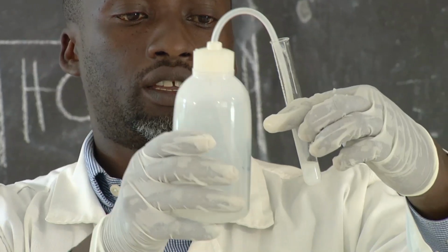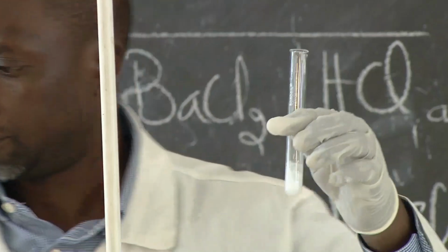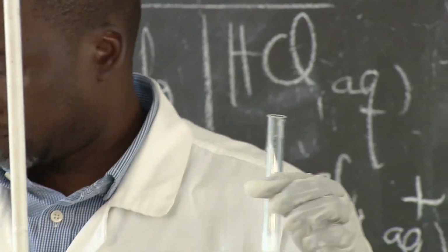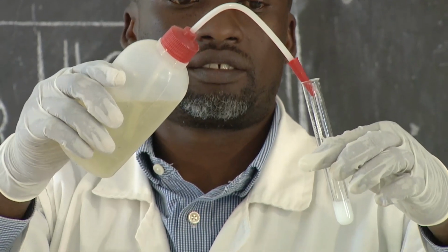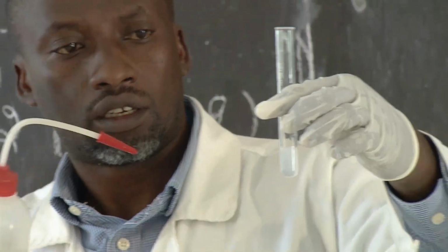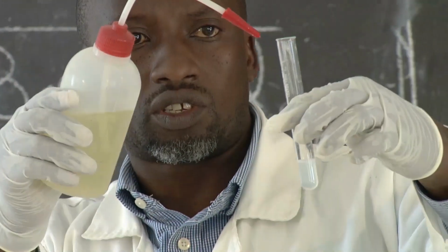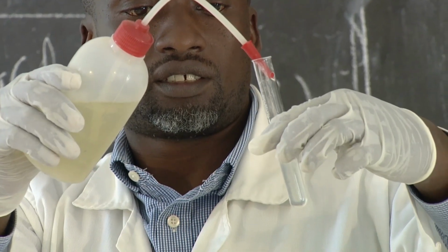See what is happening? The same precipitate is forming. Let's add hydrochloric acid. We're adding hydrochloric acid. Just take a very close look at this.